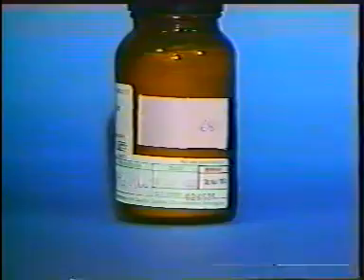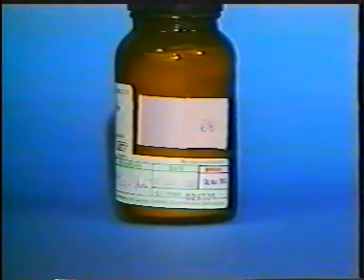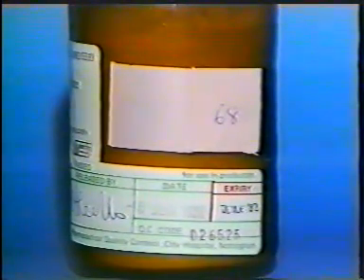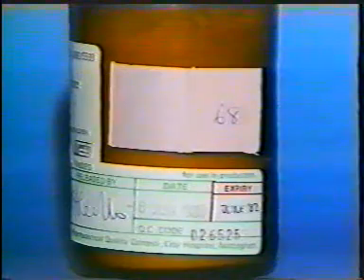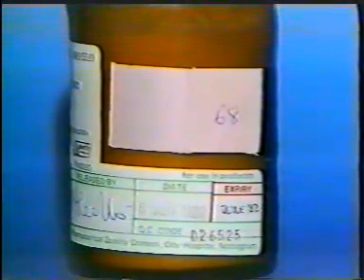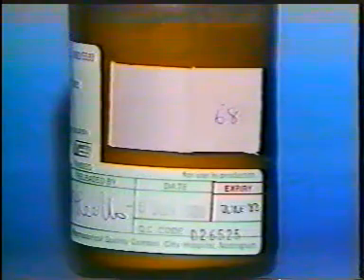All raw materials which are found to be satisfactory are labelled with a release label, which is signed by a quality control pharmacist. This label shows date released, expiry date, quality control code number. It is the quality control code number which is quoted on the manufacturing batch sheets and not the manufacturer's number.